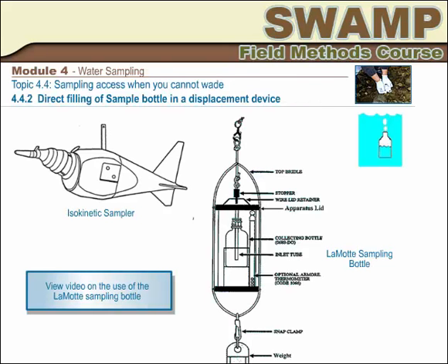There are air displacement devices that hold the container within their structure and allow you to collect samples from discrete depths for special purposes. A displacement device has an intake opening separate from the air outlet, and when lowered into a water column, water comes in through the intake, which is usually equipped with a pipe leading into the sample container. Air then escapes through the other hole in the ceiling or the wall of the container. Because sample water enters the container through an intake tube, the devices need to be cleaned thoroughly between stations.